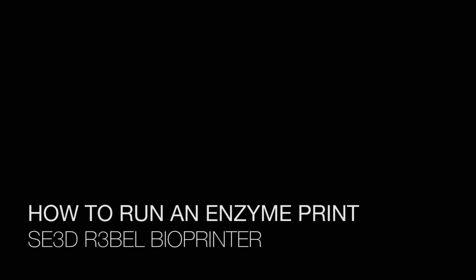In this video we will cover how to run an enzyme print. The steps for running an enzyme print are very similar to those for running the bacteria print assay.